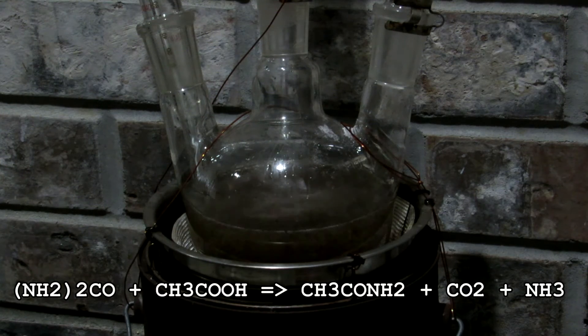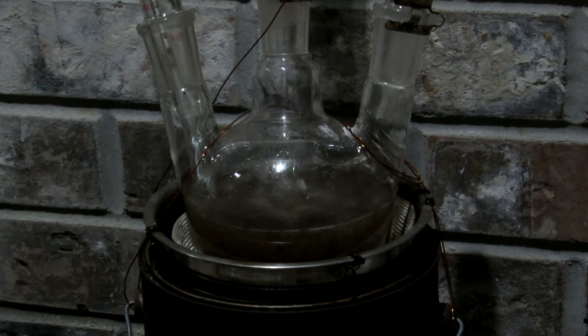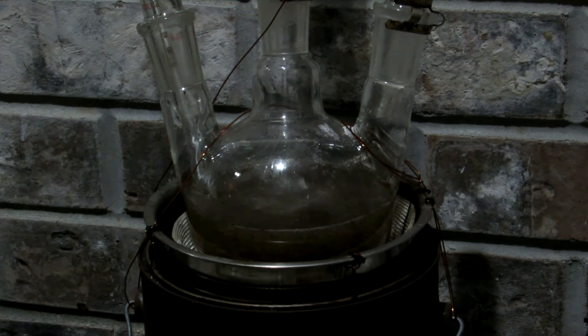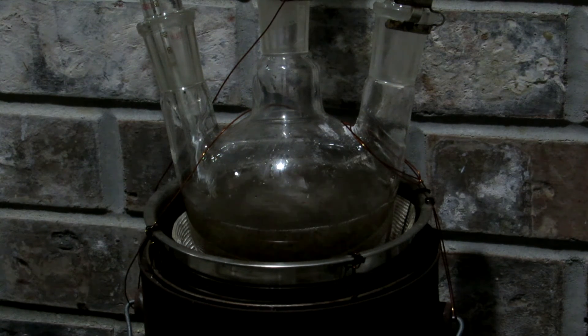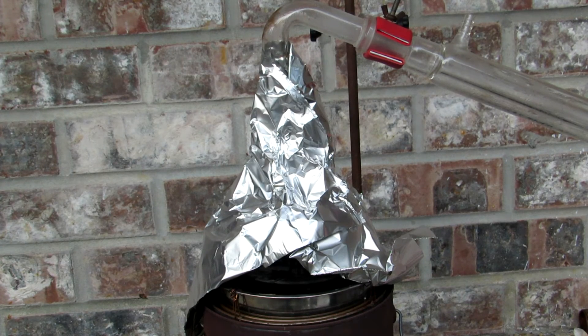It may be necessary to insulate with aluminum foil just to help everything come over. In total I refluxed for approximately eight hours, reaching about 200 degrees Celsius. I then let the reaction mixture cool, but not to room temperature, because we don't want the acetamide solidifying in the flask. Once it was cool enough, I transferred it into a round-bottom flask and set up for simple distillation.